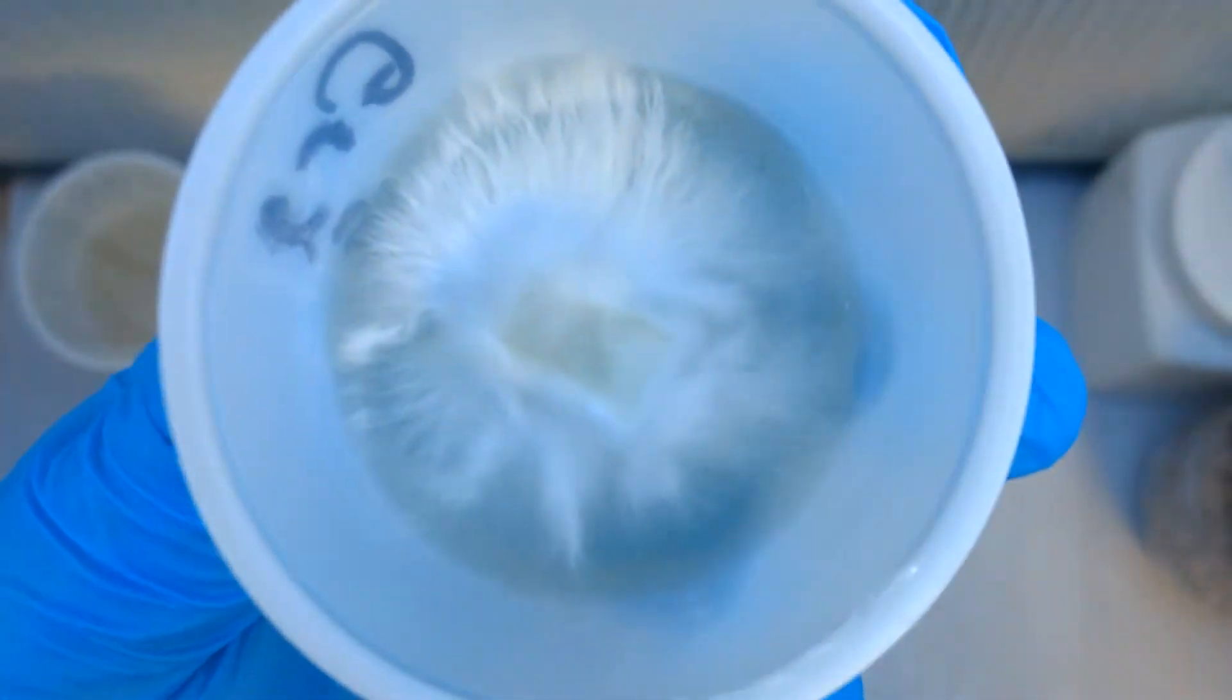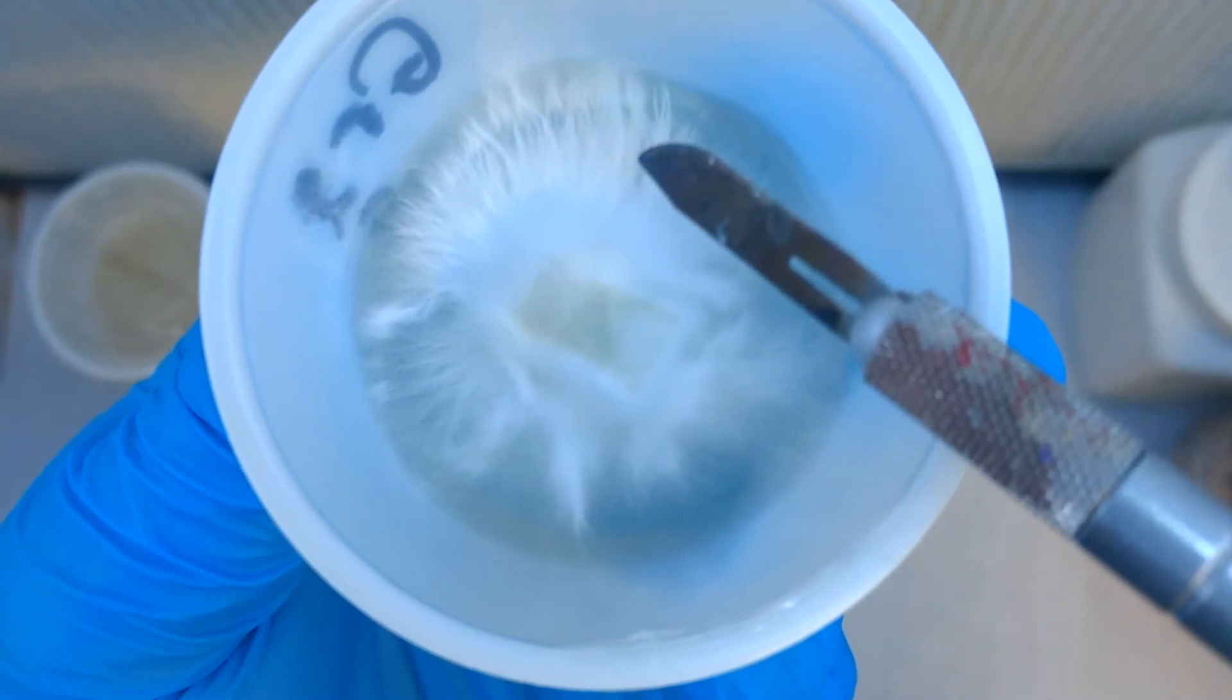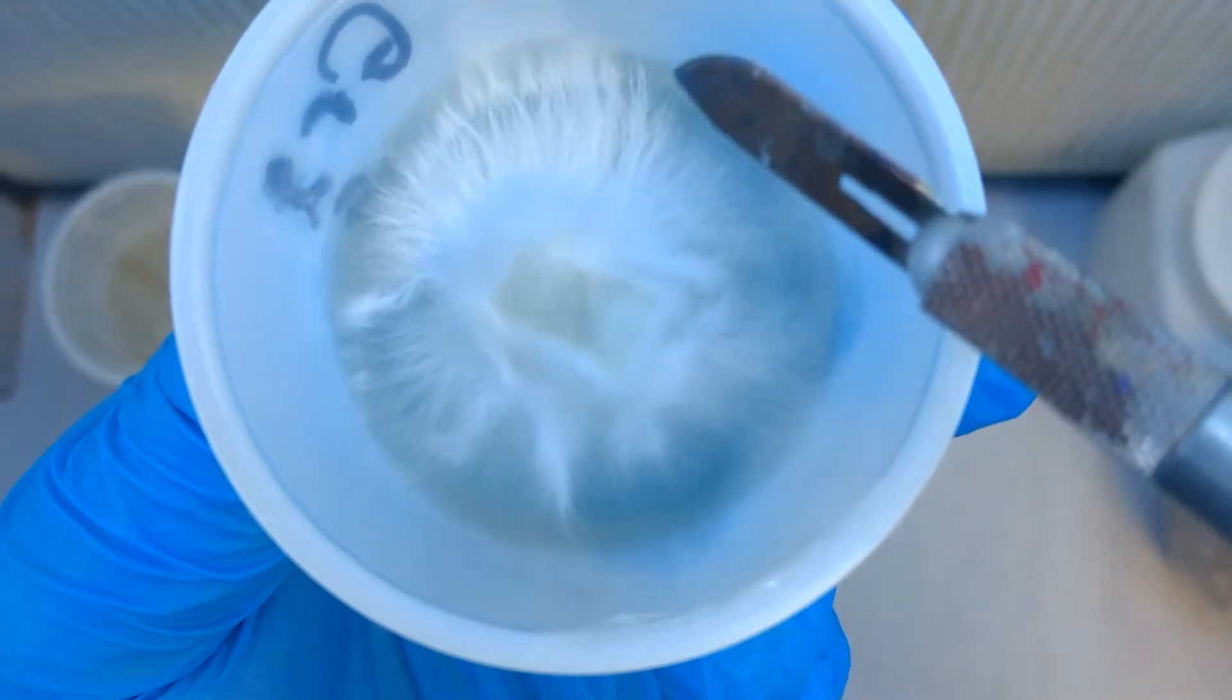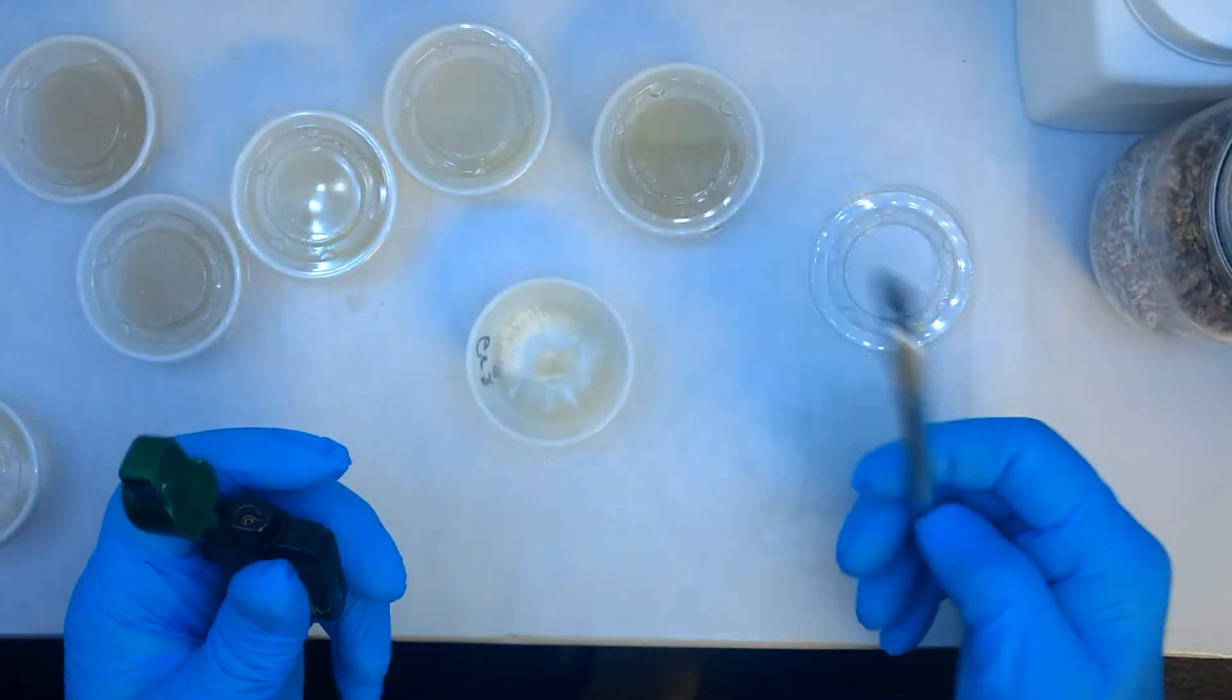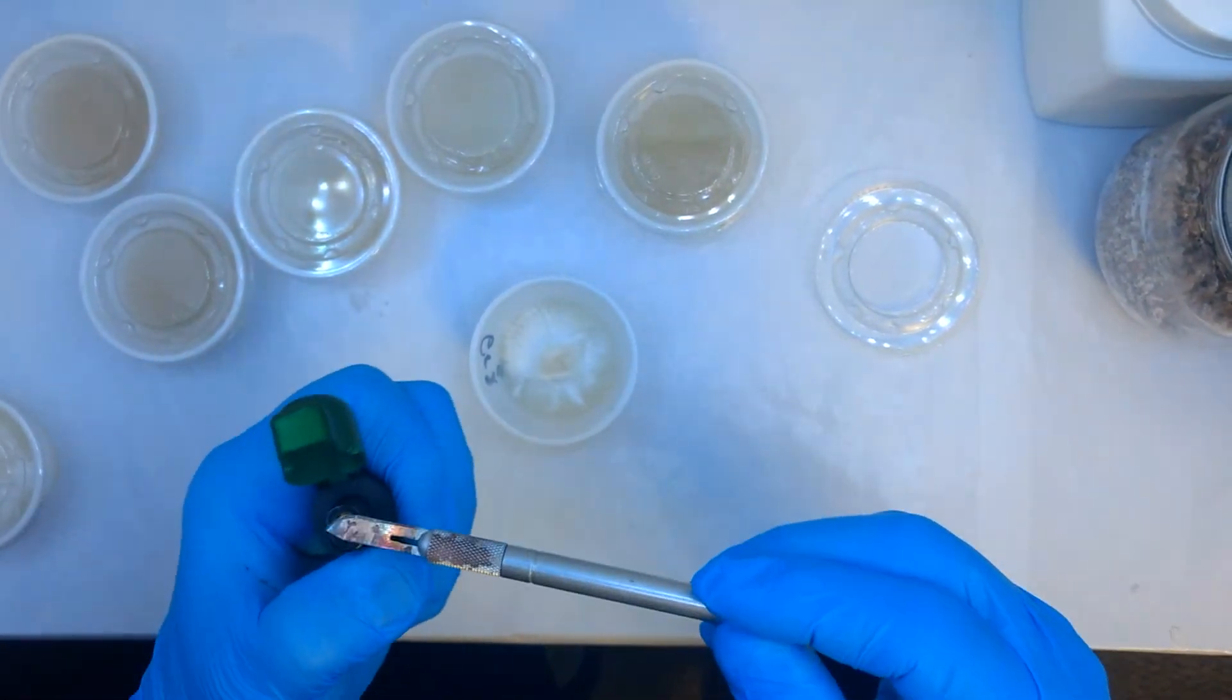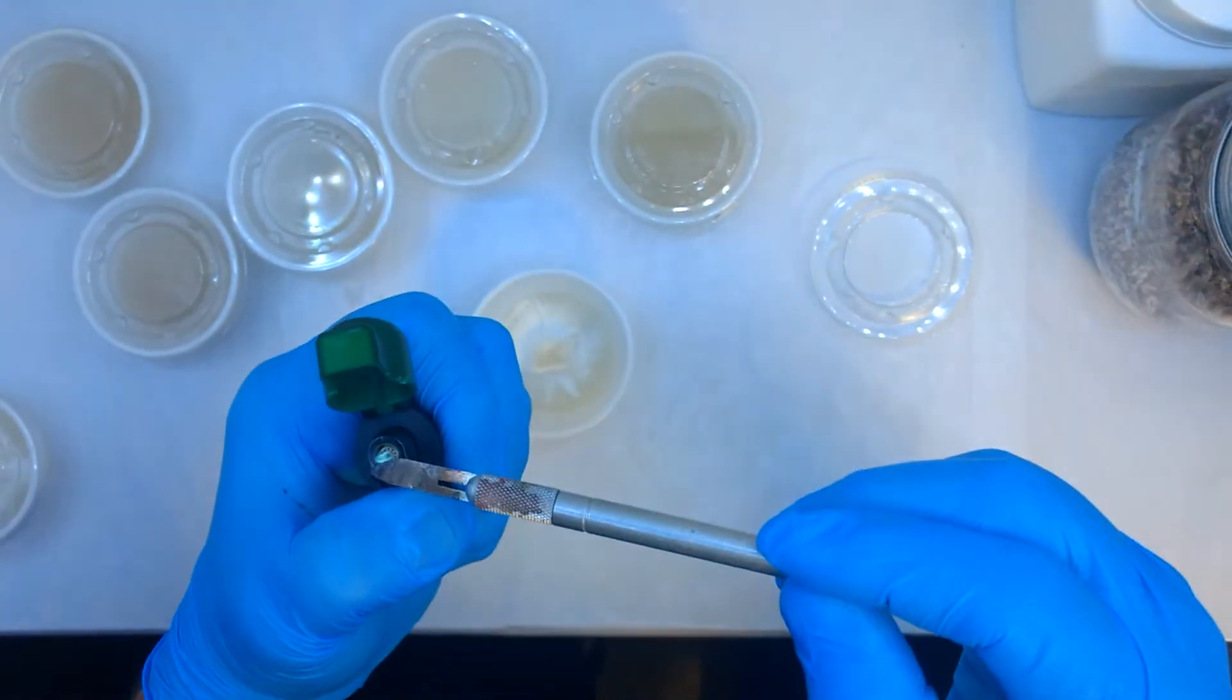So we're going to be selecting these stronger branches, like a tree branch, and placing those onto more agar dishes. This will keep the strain going, keep the strain strong, and you can put that agar into your grain spawn or into liquid culture.